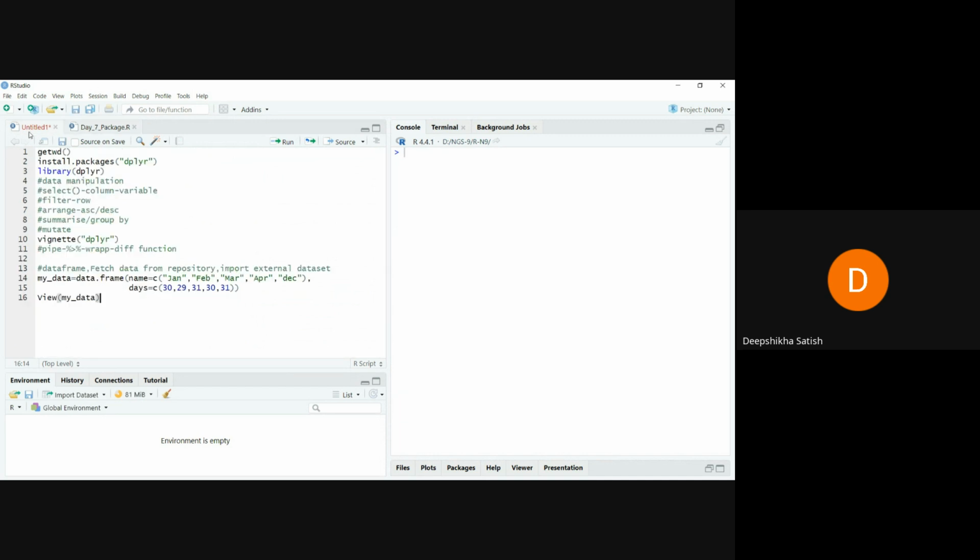So yesterday I told you to download this from CRAN itself, right? You need to download and activate this package by using the install command and the library command. Let me activate this package. So as I said, for data manipulation, what all things can we do? Here you can see the functions I have written.